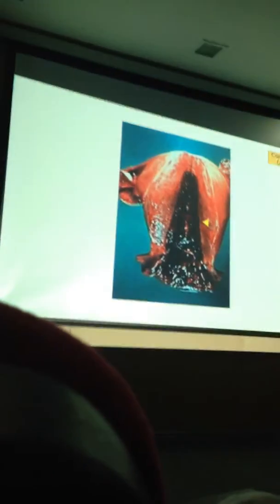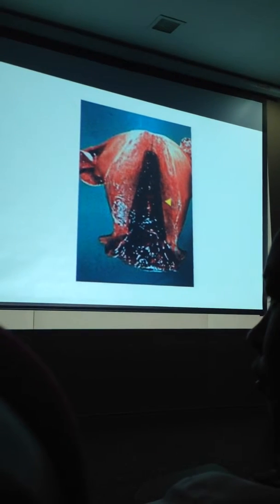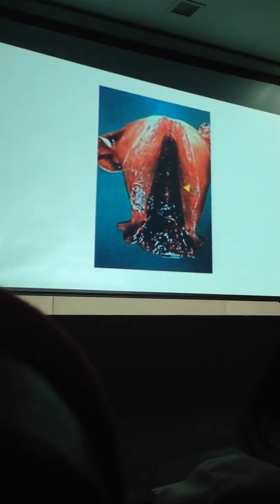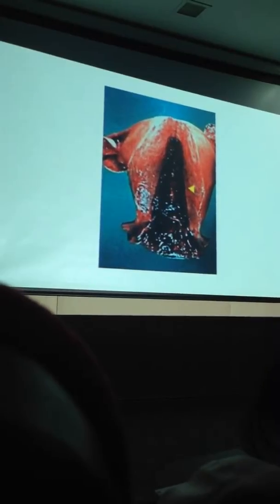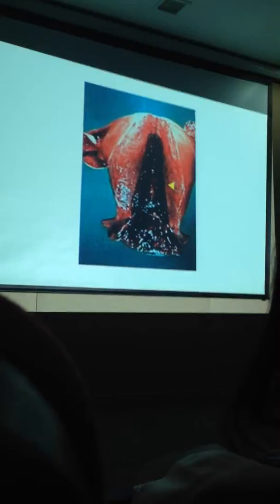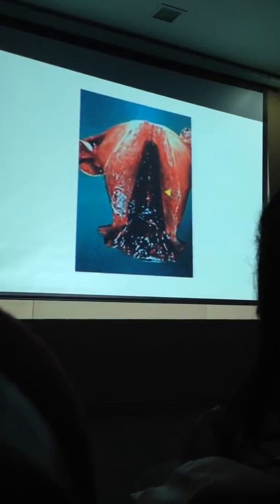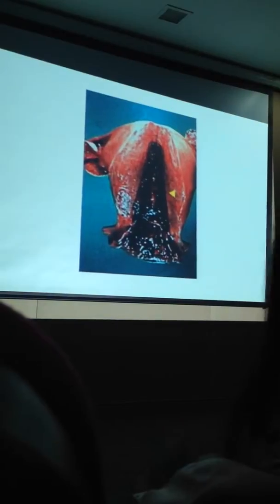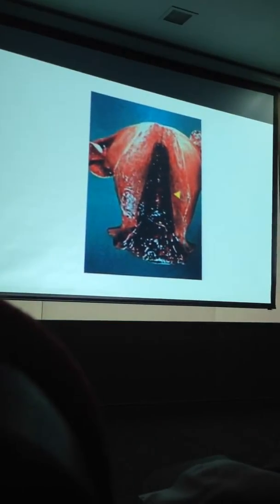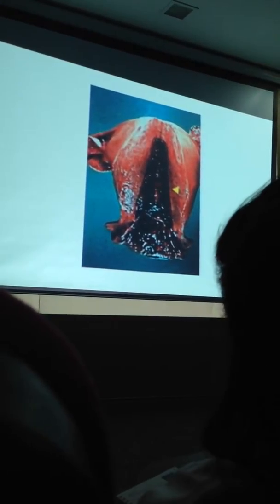And lastly, okay, this is a uterus. You know, usually a uterus, like single women of reproductive age, usually their uterus, when you get to it, it's mga fist size lang yan. Fist size. Okay? And in the screen, as you could see, it's markedly enlarged. No? And you see thickening of the myometrium.